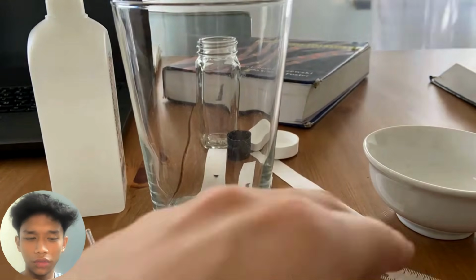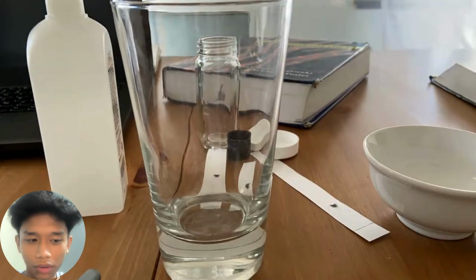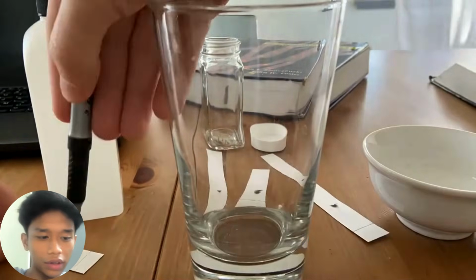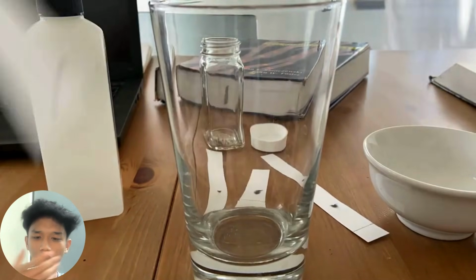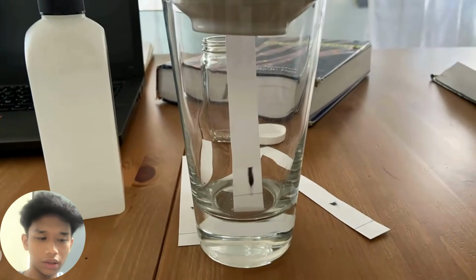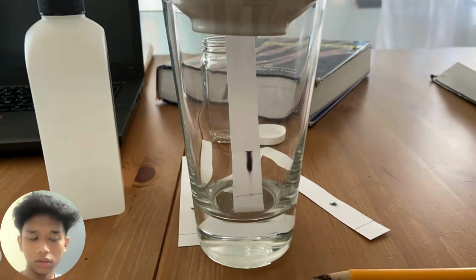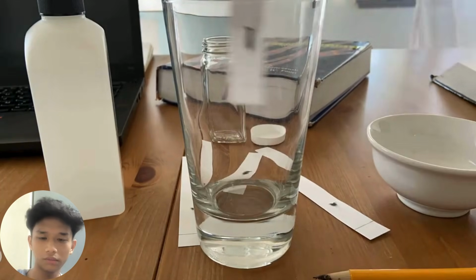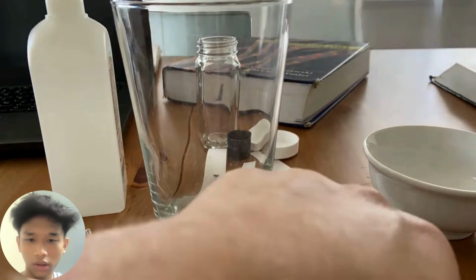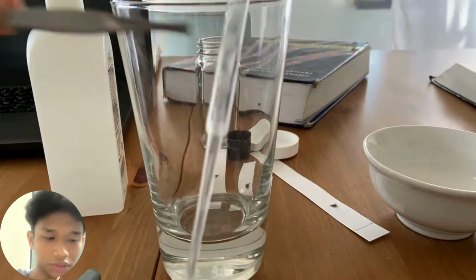Okay, now this video will show you these 4 basic properties that I told you about in the previous slide. The first one is different affinity. In paper chromatography, the black ink separates into different colors because each dye has a different attraction to the paper and the water. Then we have the stationary and mobile phases. For paper chromatography, the stationary phase is the paper inside the glass, and the mobile phase is some liquid under the glass in this video.